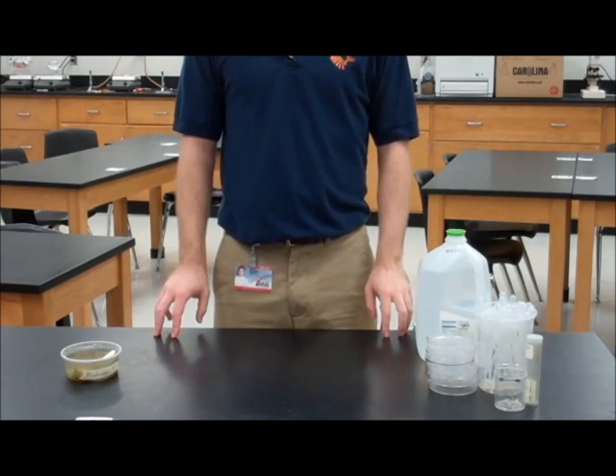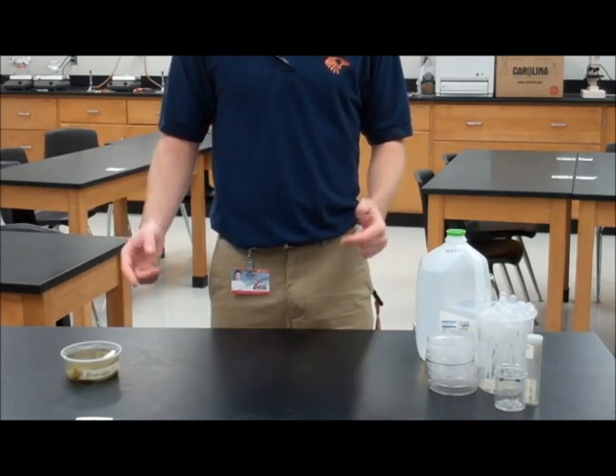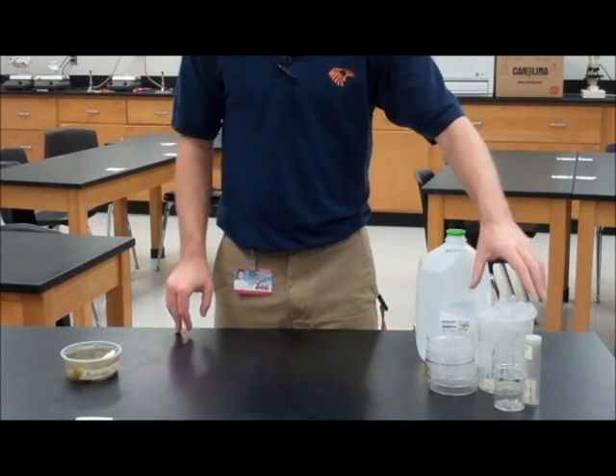Hi, I'm Michael Ralph and today we're going to be looking at black worm pulse rates. You're going to need everything you see right here, including black worms, capillary tubes, and pipettes.